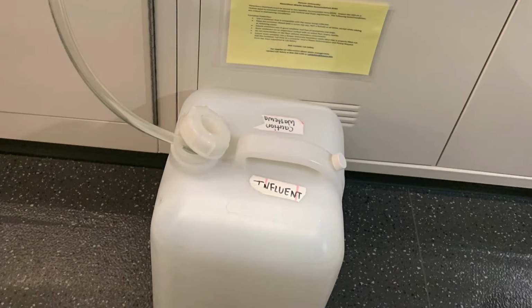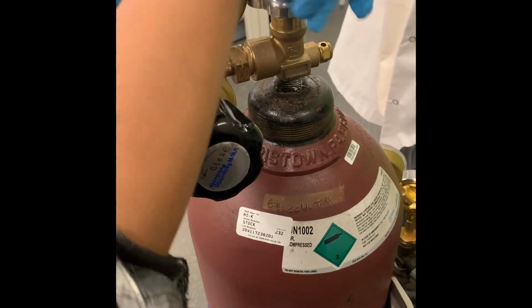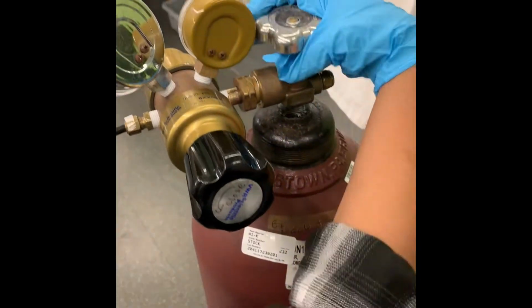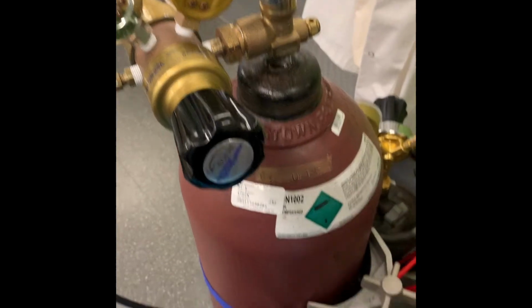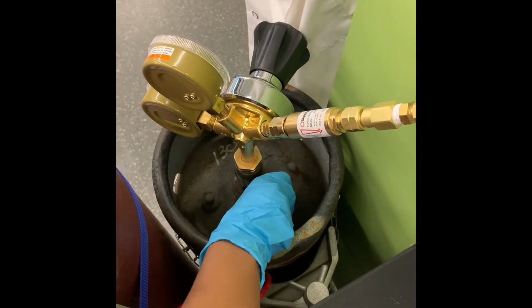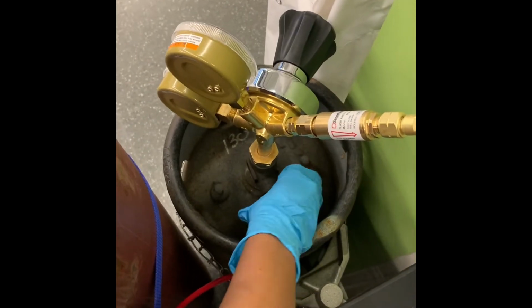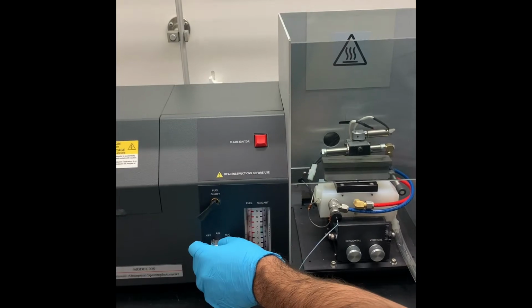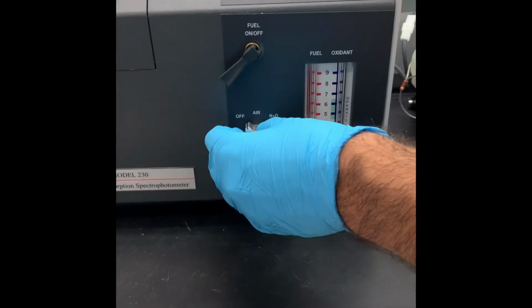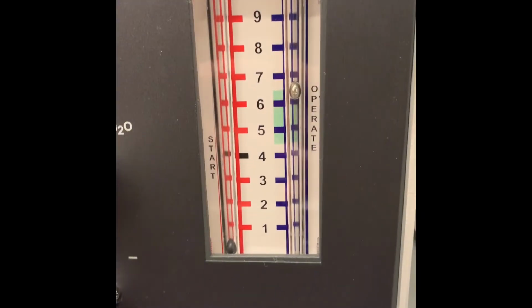Before anything begins, ensure the tube is properly connected to the bin. Turn the compressed air knob anti-clockwise to open the valve. Once the compressed air valve is open, you can open the acetylene valve by turning it anti-clockwise as well. Turn the valve to turn on the air and ensure that the ball on the right is measuring between 4 and 6.